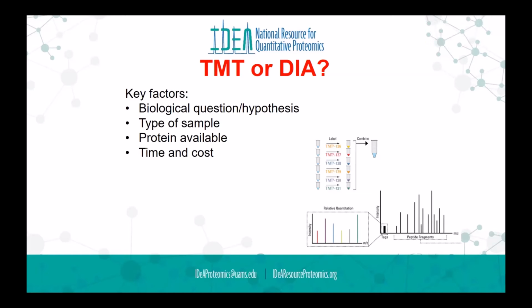Okay, that seems like a better option considering that with nematodes, since they're barely a millimeter in length, getting a lot of protein content is kind of laborious in itself. Thank you. Okay. Great, perfect. Anybody else?